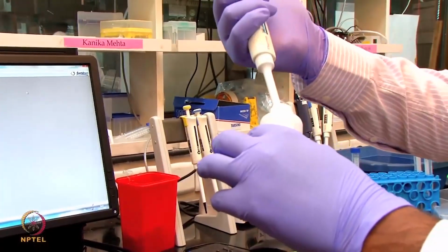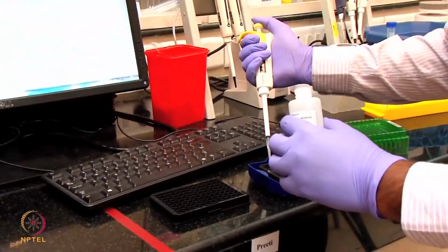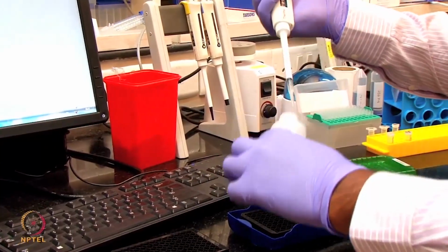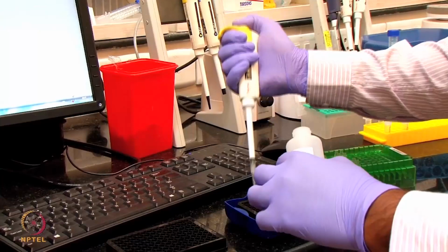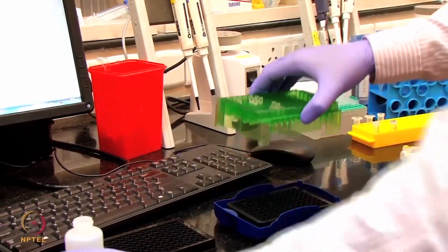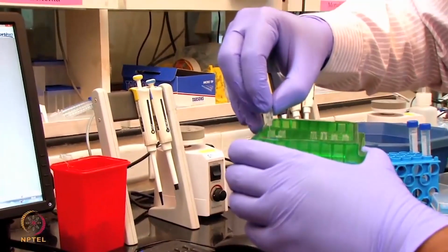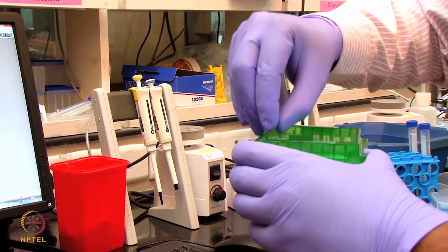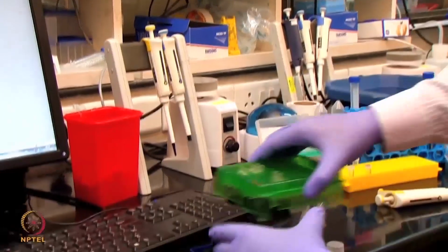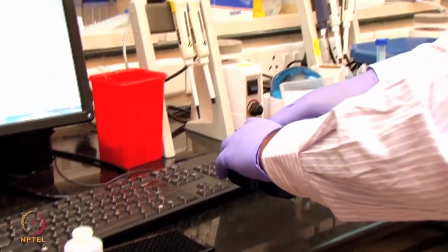Here I am going to take 200 microliters of this PBST buffer and add it in A2 and B2. Now the sensor position I'm changing from A1 B1 to A2 B2. So now I will start the equilibration of the sensor with this particular buffer.